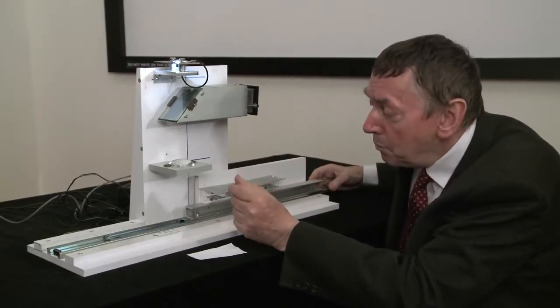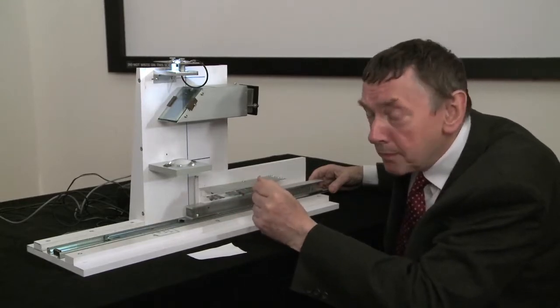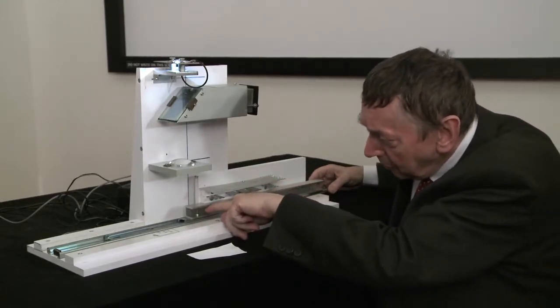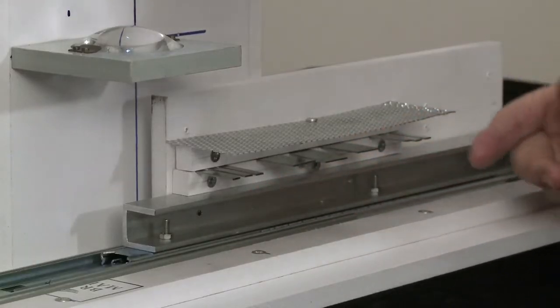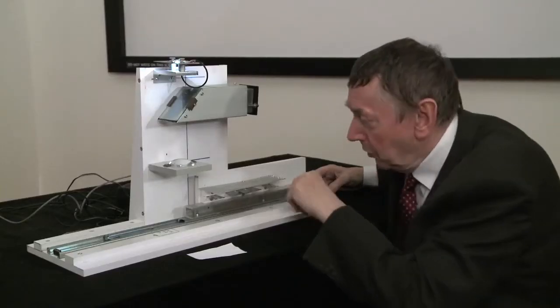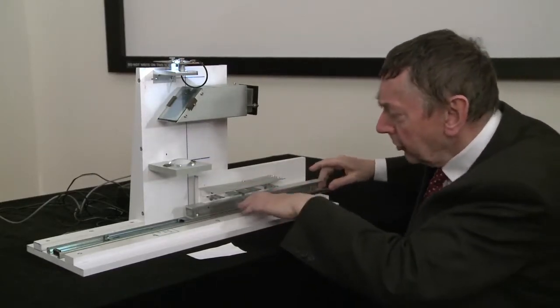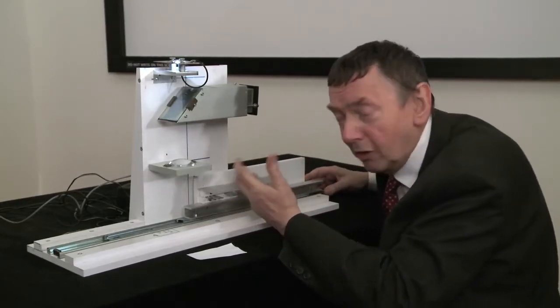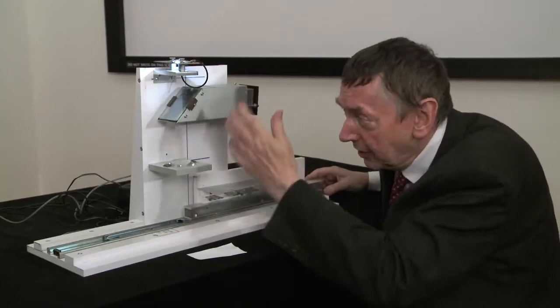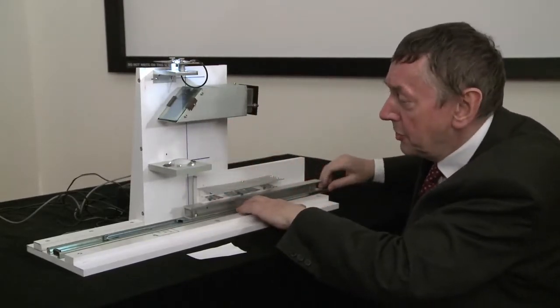It should go beep, beep, beep, beep, beep, beep, beep, beep, beep. And then at the bottom level, we have a continuous aluminium sheet which will reflect back all the time. So I'm going to slide this across, and this is exactly how the early confocal microscopes worked. You had stationary optics and you moved the specimen to build up an image.